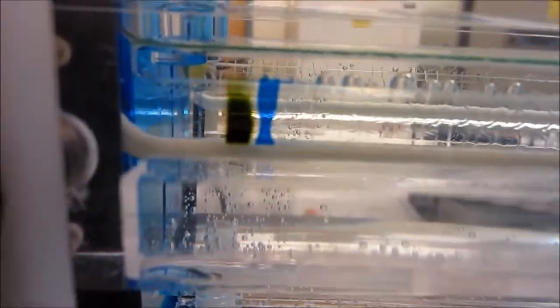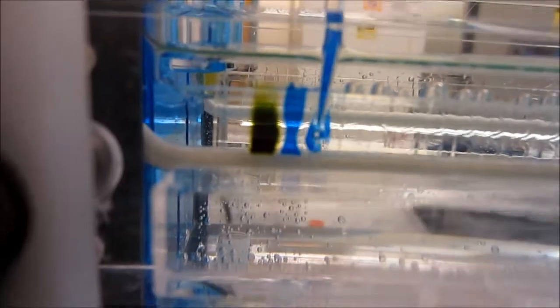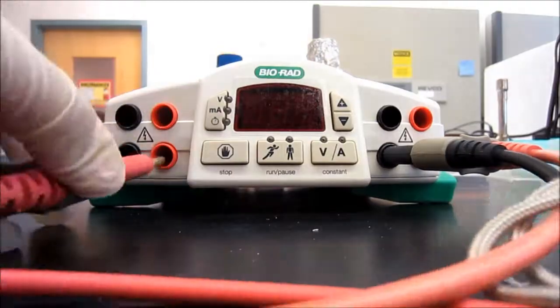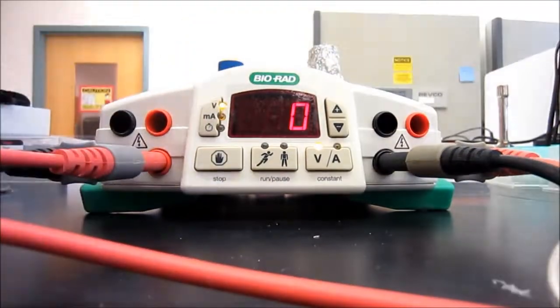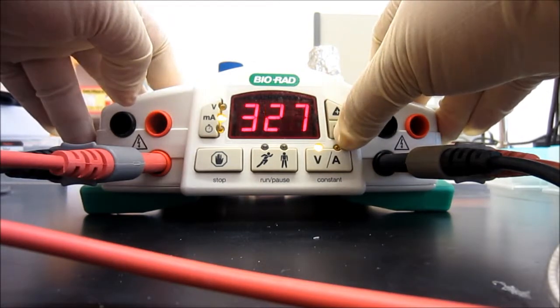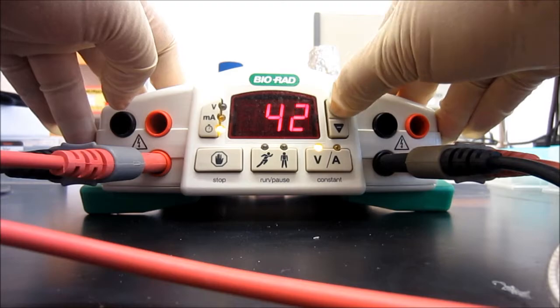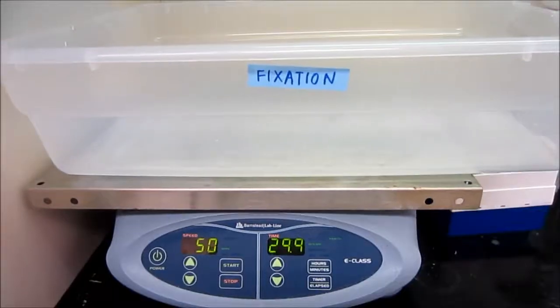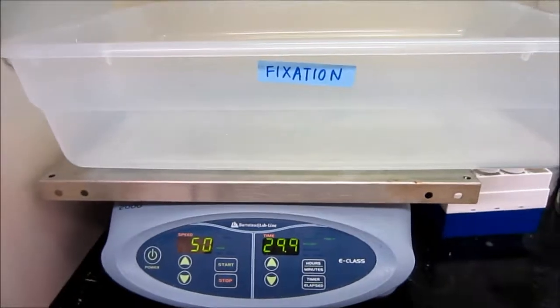20 microliters of PCR product is filled in each well. The electrophoresis condition is set to 180V and run for 2 hours. After running the electrophoresis for 2 hours, the gel is now ready to be stained.